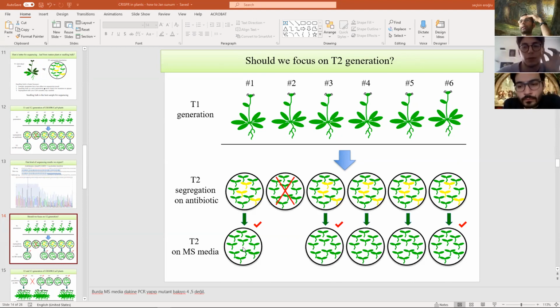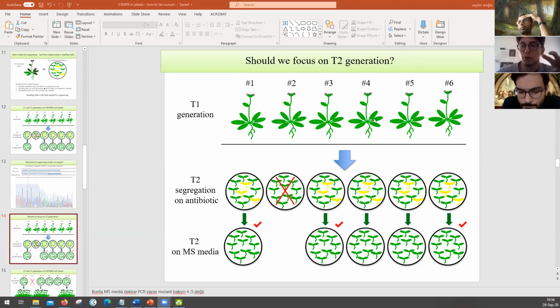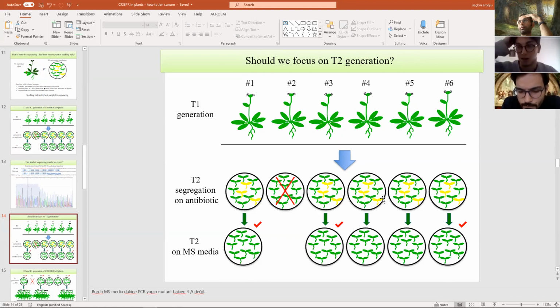Question. Yes, please. If you want a mutation on both chromosomes, why are we looking for homozygous mutants? Yeah, you're right. I mean, heterozygous. If we want to knock out more than one gene, then we cannot go for homozygous ones, because homozygous means it has the vector in both of the chromosomes. Then when we knock out the other gene, there will still be the vector inside, and there will be no other means to get rid of the CRISPR vector.